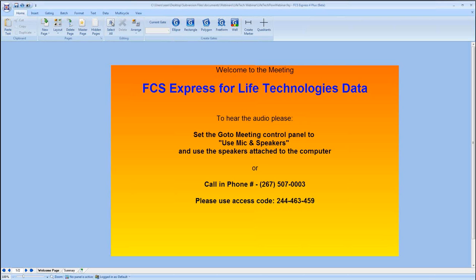So that's just a basic overview of De Novo Software. But what I wanted to do today is show you how to start working with data in FCS Express. Susan sent over some data files that I'm going to be analyzing in the software today. She had also sent over some PDFs of what that data analysis looked like when it was done with the software from the Attune.